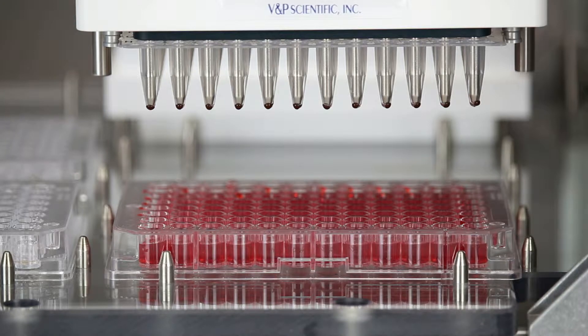You can see the pellet of magnetic beads collected on the tips of the Magpin R cover plate.